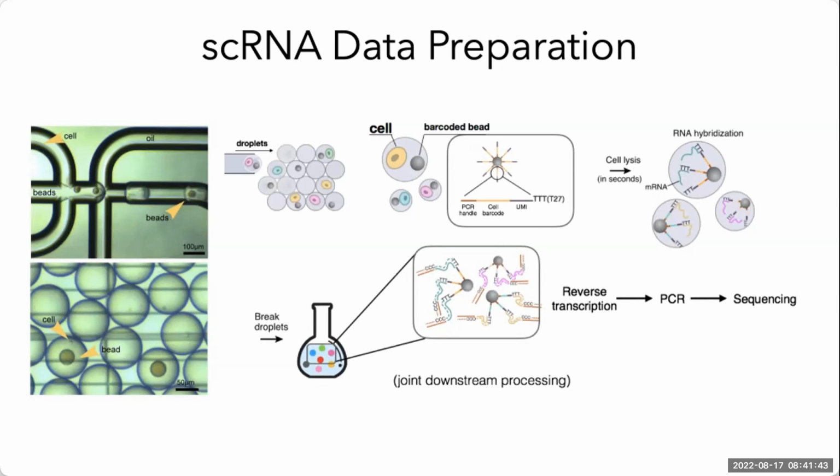As we see, UMI-based or tag-based technologies may find it difficult to distinguish specific isoforms. So if you have a sample in which you are expecting different splice variants or different isoforms of your genes, then you are better served by making use of full-length protocols instead of UMI-based or tag-based approaches.